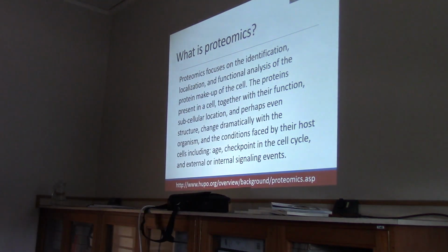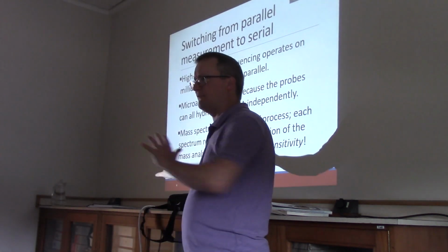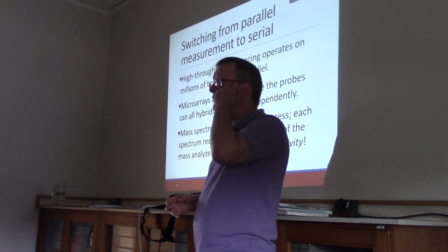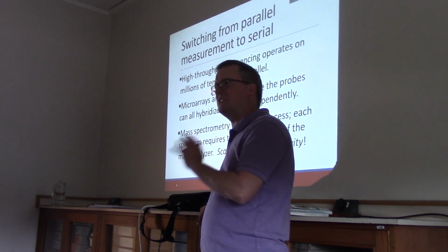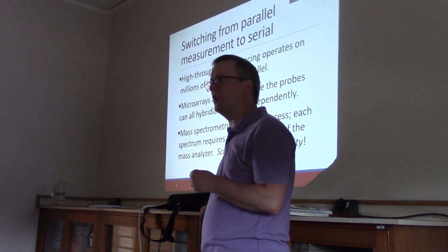Okay, so let's move ahead then to talk about a major shift that really differentiates proteomics from microarray and sequencing analysis. We've already said that in the old days, sequencers could sequence up to 384 templates at a time if you had 384 capillaries in your machine.